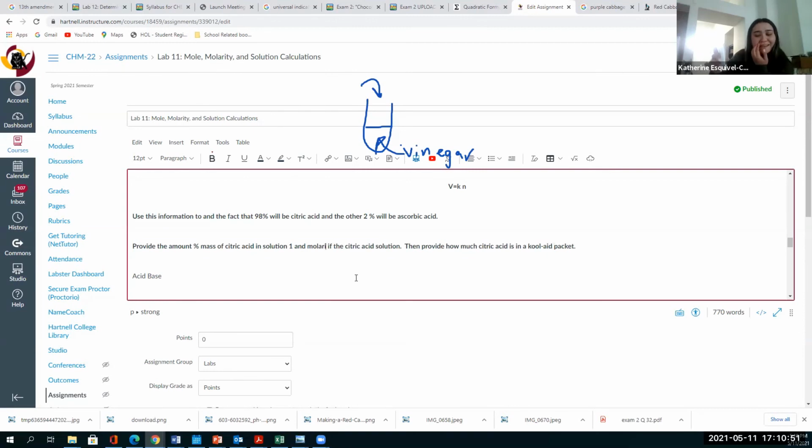Sorry, Dr. Henry. So I added a 5 and 1 or 2.